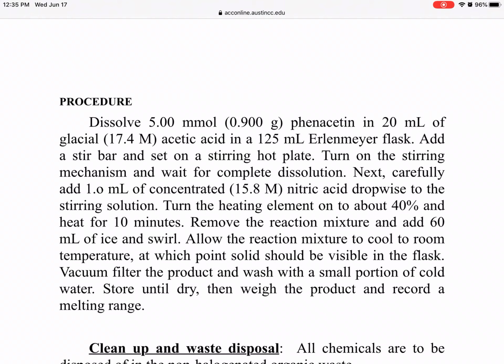Okay, and then afterwards we want to isolate our solid. It's with water and your bunch of acid components. So what you're going to do is filter it through vacuum filtration. You will see the vacuum filtration setup, and you may have already used vacuum filtration also. So you filter it, and then you get the crude product.